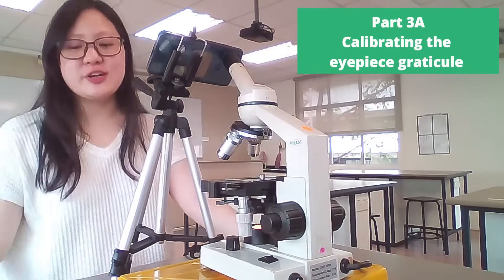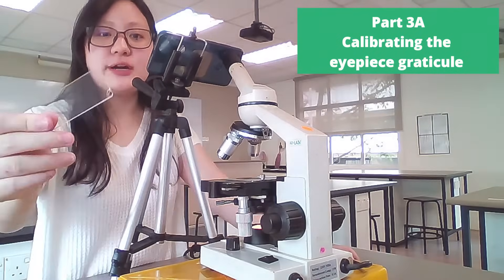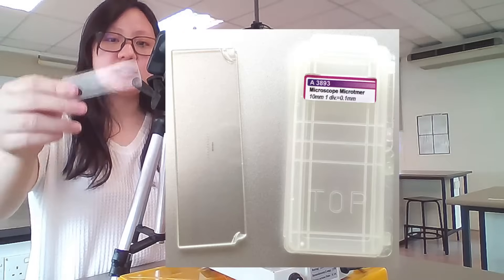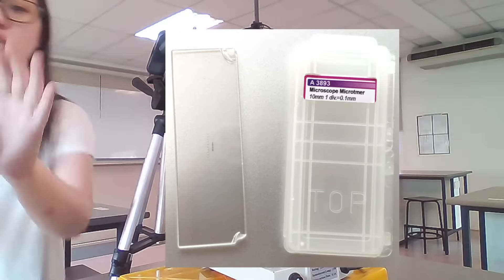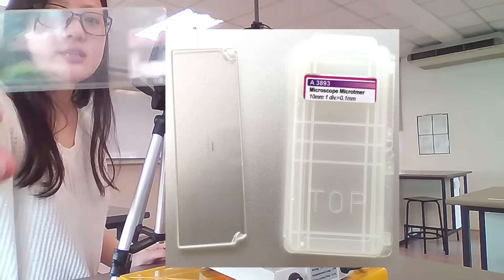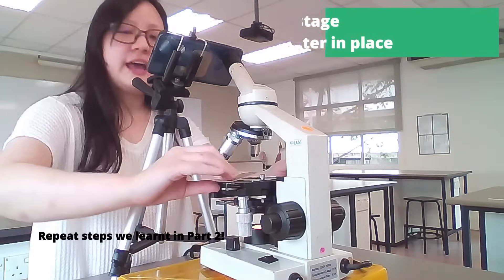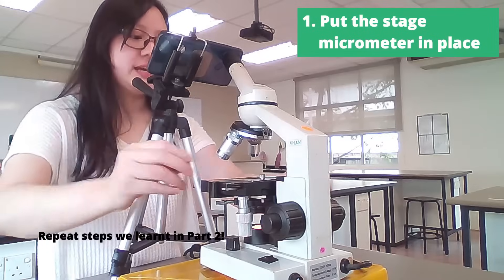One more thing you need to learn is how to calibrate your eyepiece graticule using a stage micrometer. A stage micrometer is a very small ruler on a slide. We're going to put it under the lens at the stage — that's why it's called a stage micrometer.